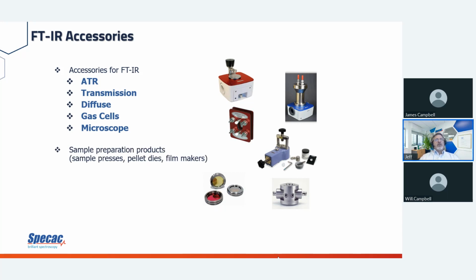To make that KBr pellet, you need a press and a die to do that with. I need a thin film made out of a polymer. You need a filmmaker to work with that. Polarizers. If I polarize it one way, I'm going to get one piece of data. If I do a 90-degree from that, I can get my S and P polarizations.